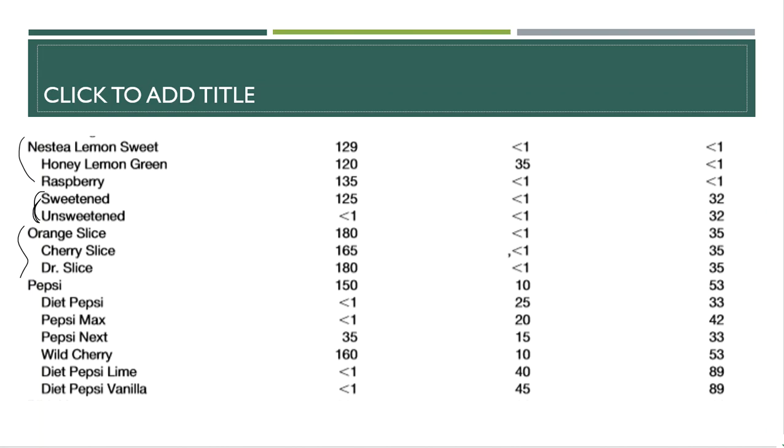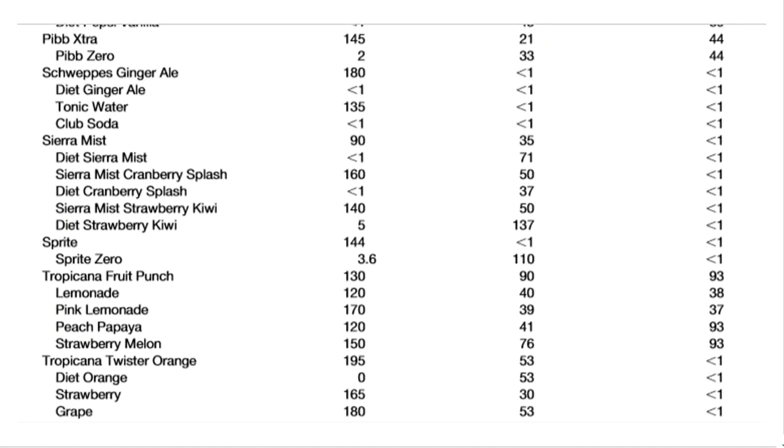Here are your oranges and your Pepsis. Again, all of those are going to peg positive for phosphate. Pepsi really is no better than Coca-Cola. However, if you like the diet versions of Pepsi and the diet versions of Coke, then the diet versions of Pepsi are going to be about triple the amount of the diet versions of Coke. Next screen, this is the last one.